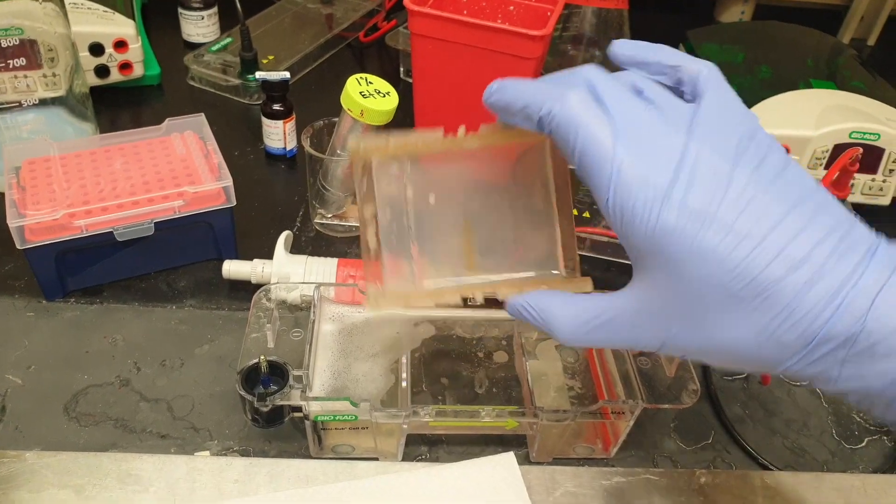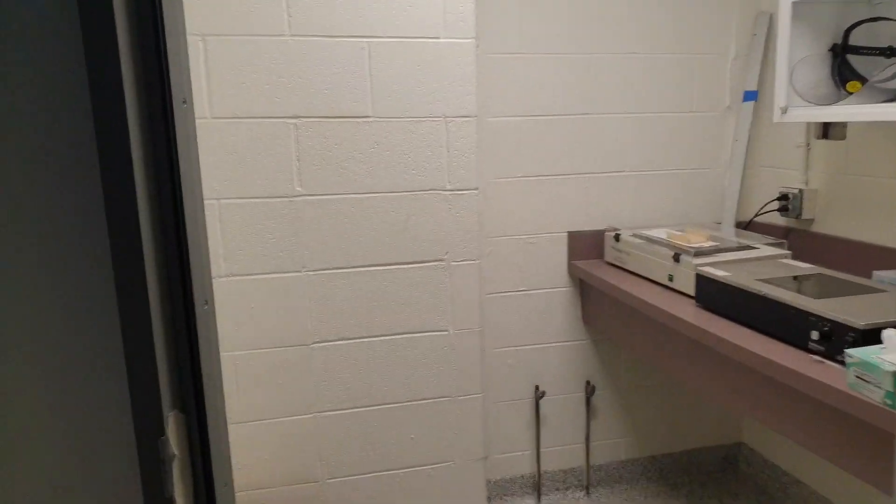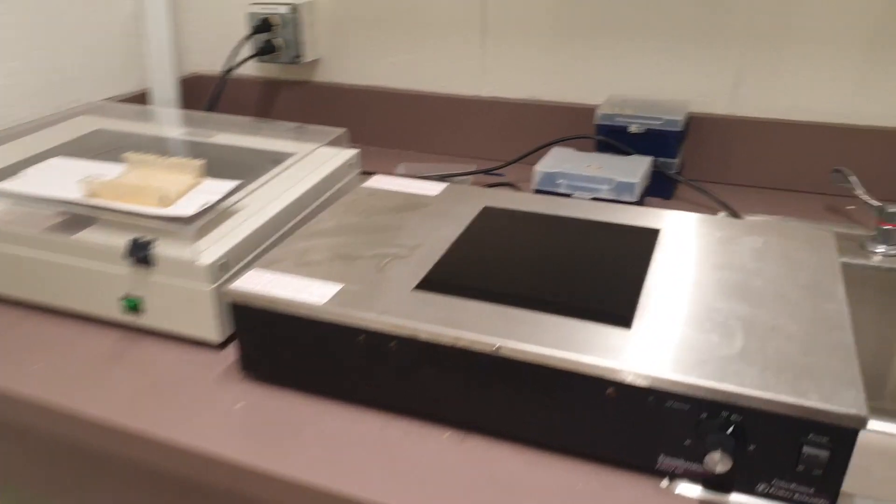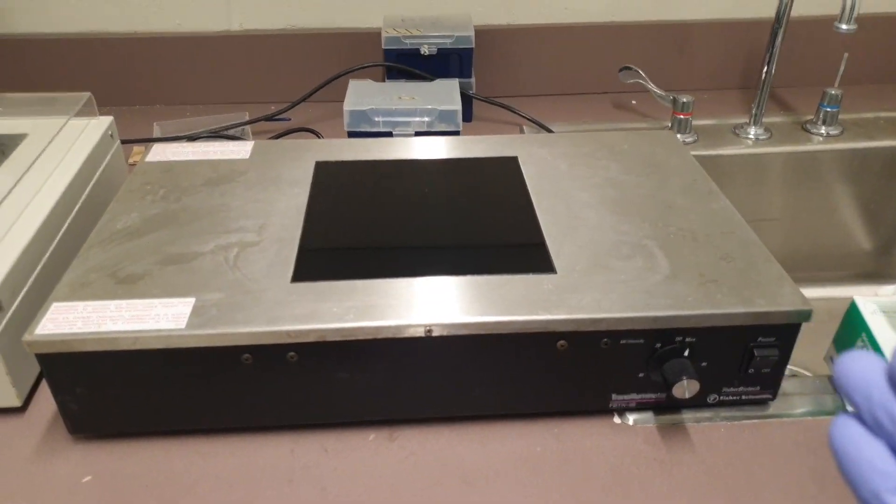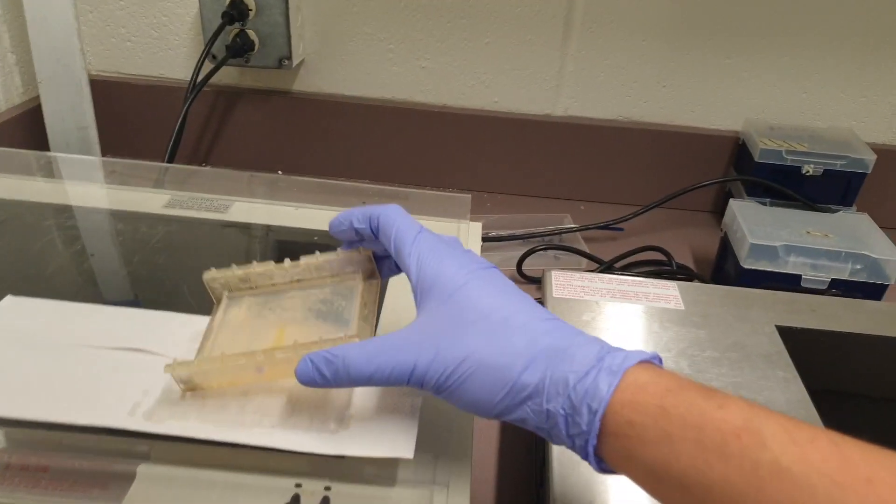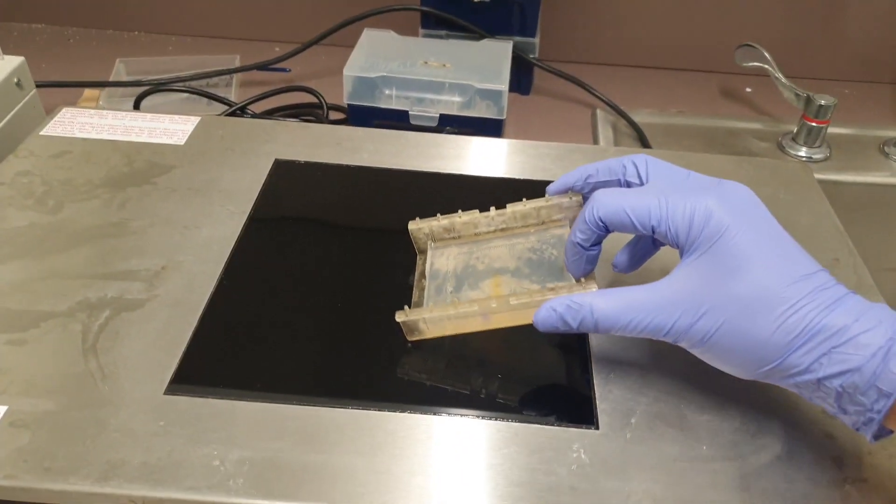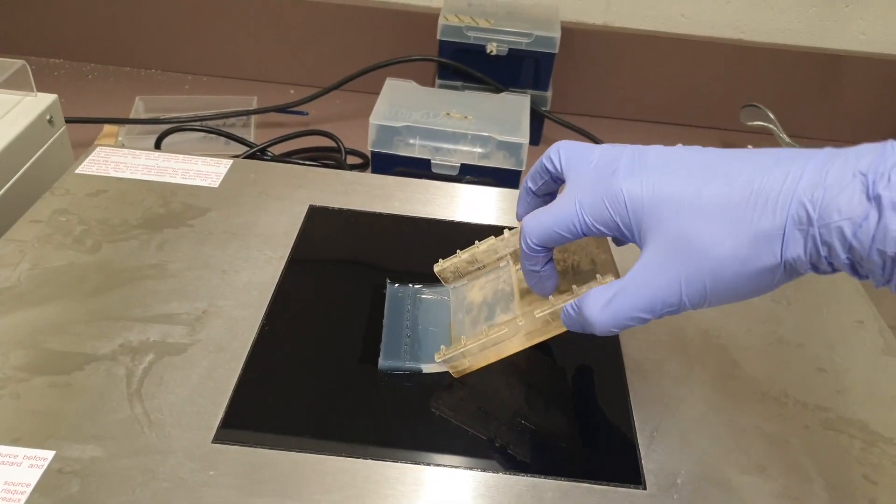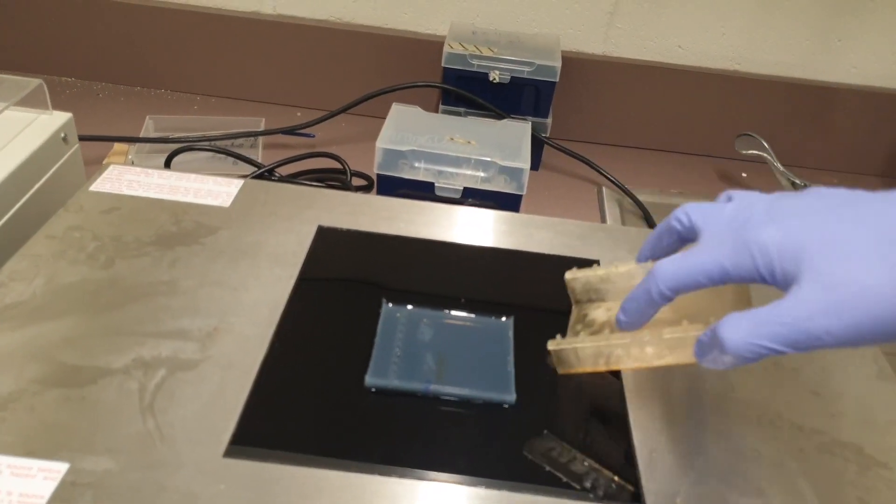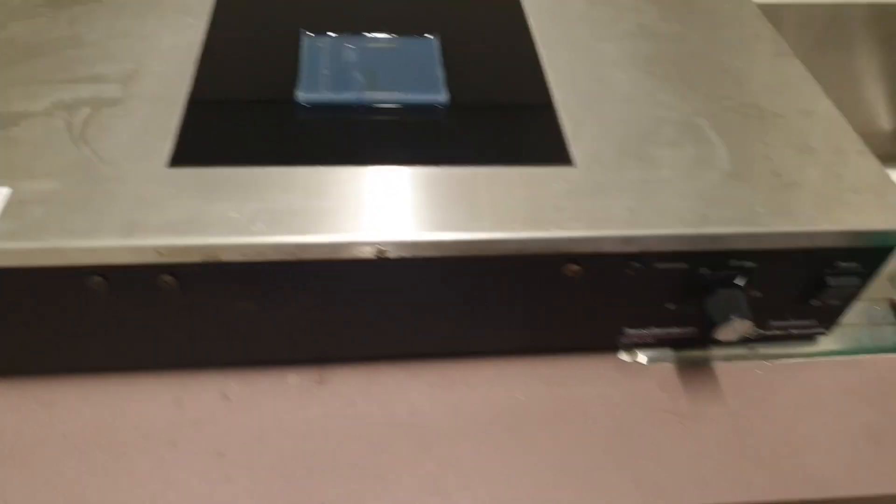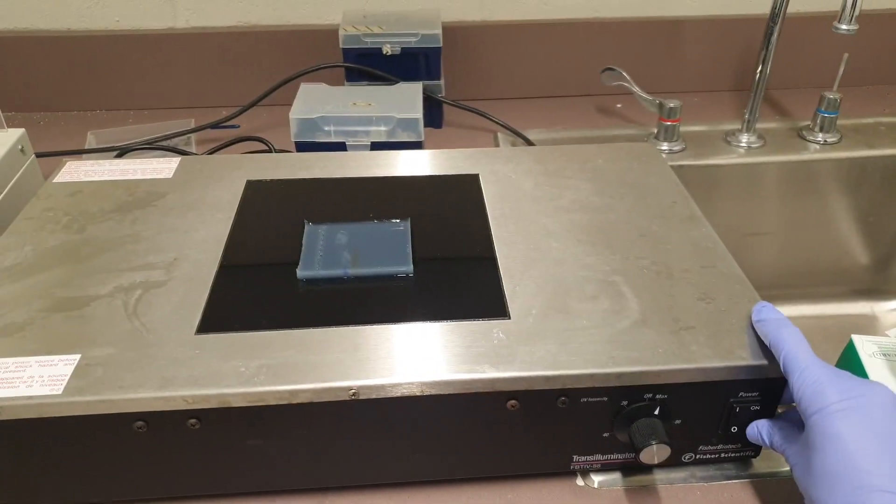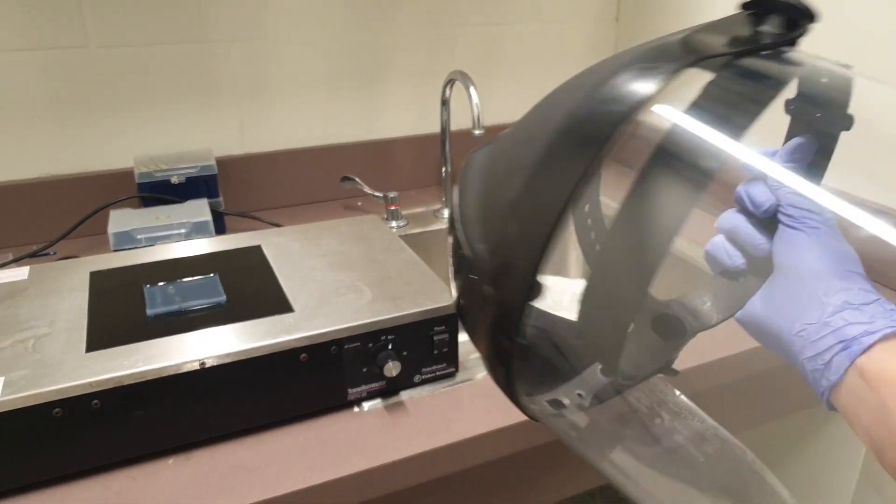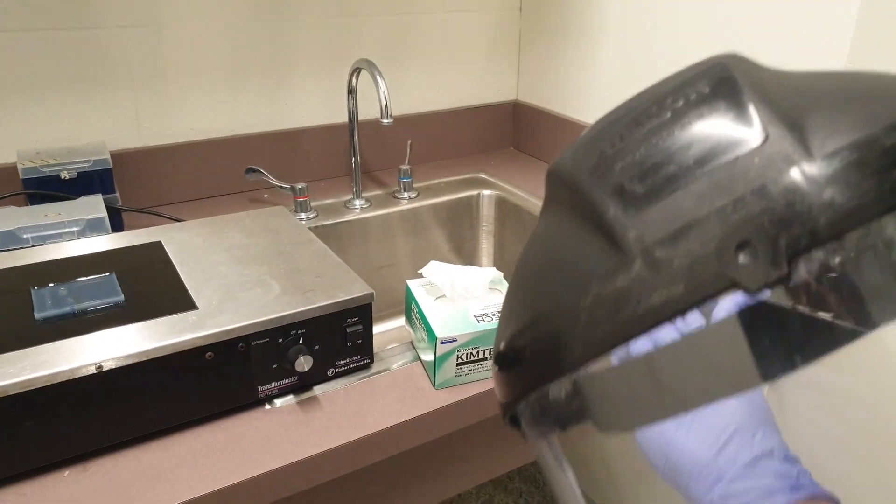Now we'll take this plate to the darkroom. Alright, so now we're in the darkroom. This is the UV box we're going to use. Let's slide our plate on top of it. Let's be careful because this is quite fragile. Once we turn this on, it's going to create this purple light. But before doing that, we need to use these UV protection shields.